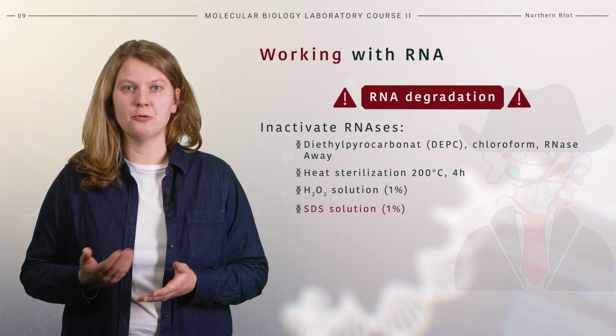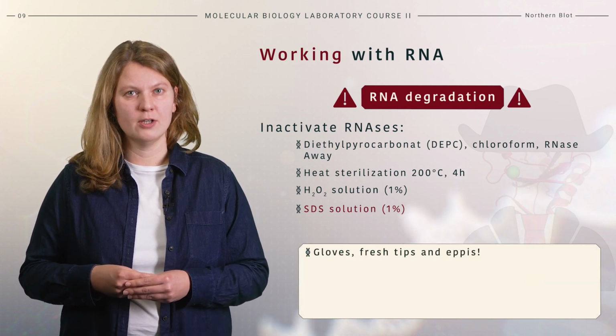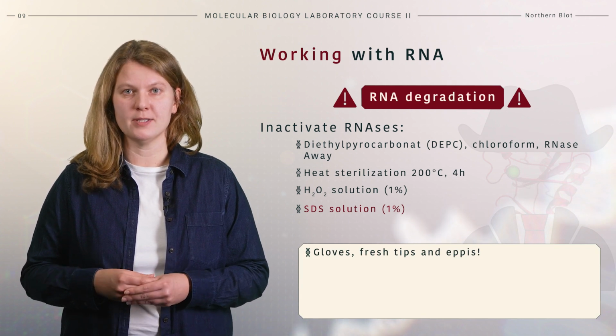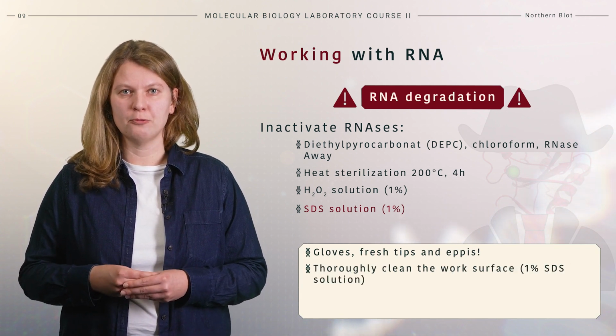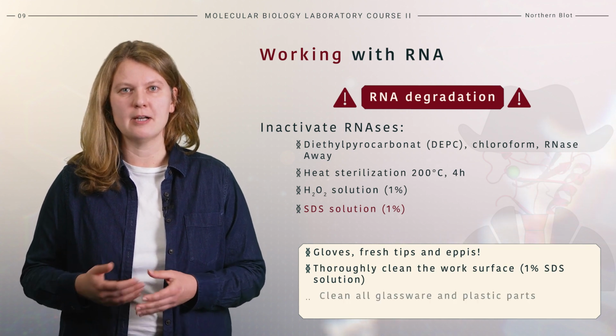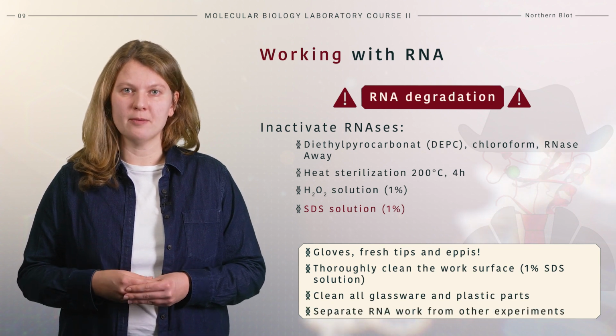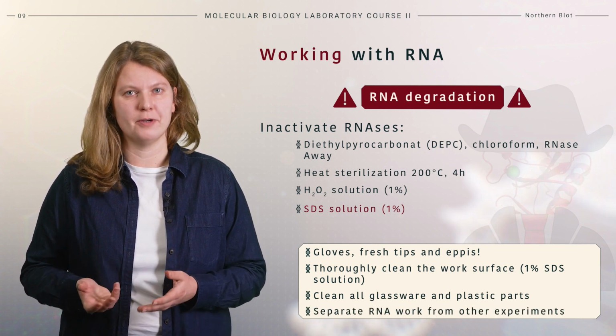Here are also some tips for working with RNA. It is important to wear gloves and use sterile fresh tips and epis. Sodium dodecyl sulfate solution should be used to clean the work surface, all glassware, and plastic parts. And finally, make sure to separate RNA isolation from other experiments.